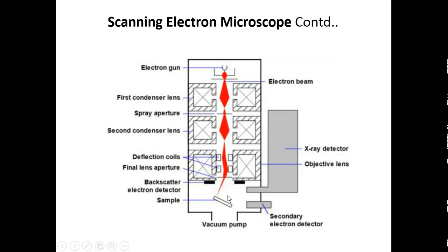Of course, we will learn what all the important specimen interactions possible in the SEM technique are.